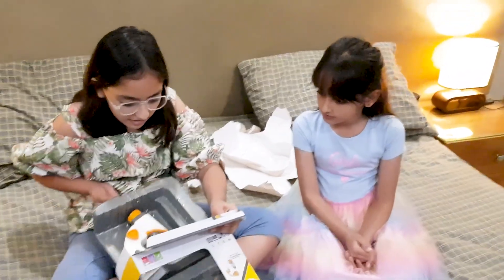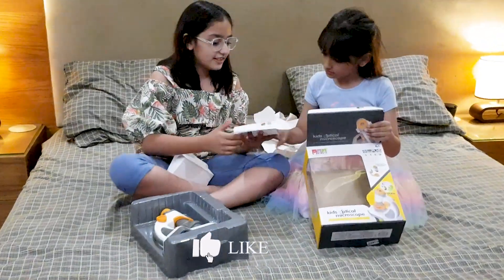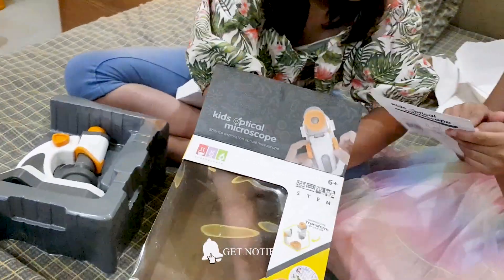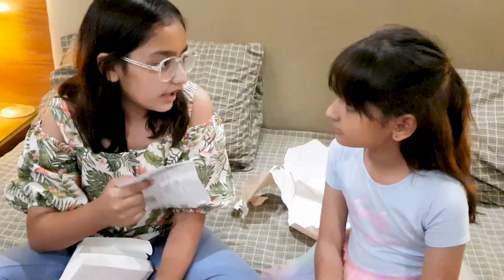That's my stuff. Oh my God. There you go. Let's take this, let's open it. Wait a second — it says we need cells here. Oh, it says two AA batteries. Can you get them? Sure.